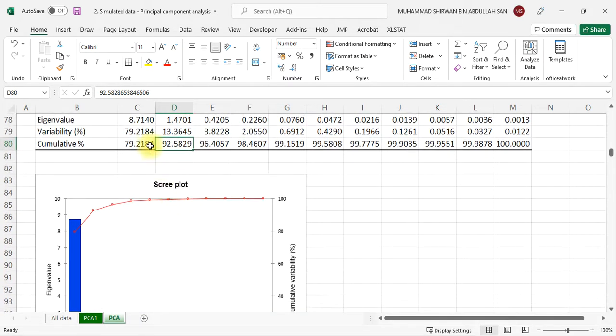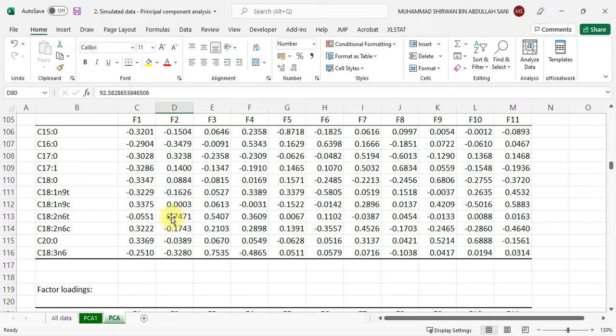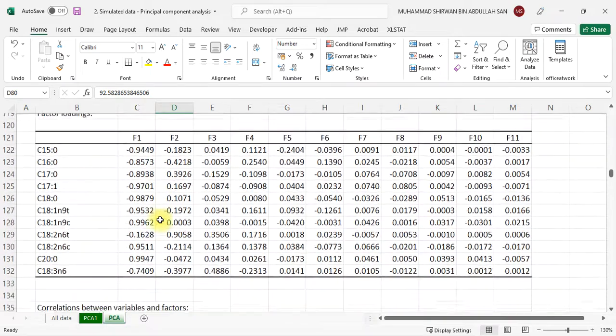So the question is, how come we can get this 92%? Because from the DA, we get the 13 variables, 11 are the significant ones, and all those 11 are forwarded to be used for PCA. That's why it can achieve a high accumulated percentage of variability. If you use all 13 variables, the same as the DA, the percentage of accumulation will be reduced. Not all will be meaningful, because DA already proved to us the discriminant. Okay, this one is not an important one.